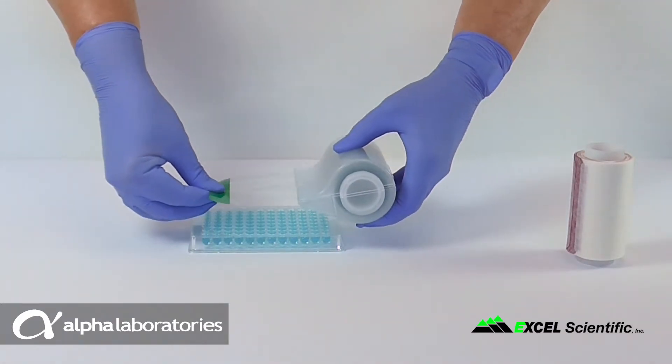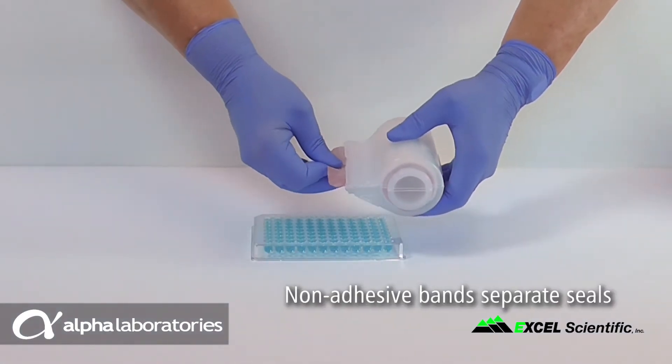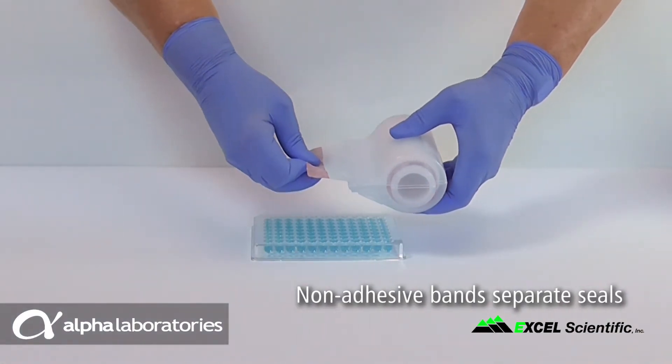Thumb and forefinger notches above and below the film at the edge of the dispensing bill provide access to the non-adhesive band to facilitate pulling the next film from the dispenser.